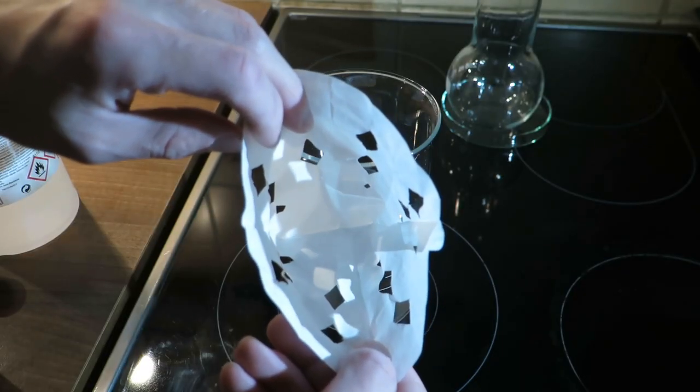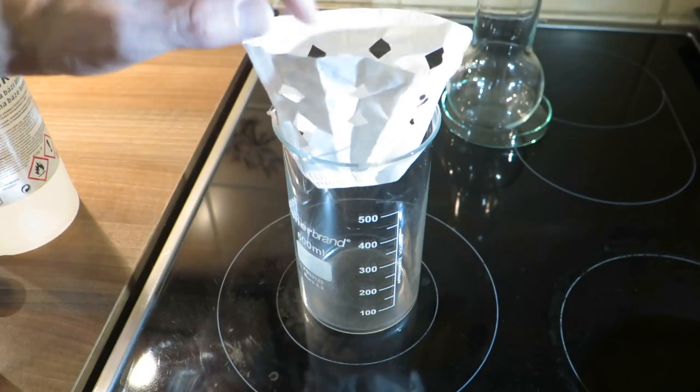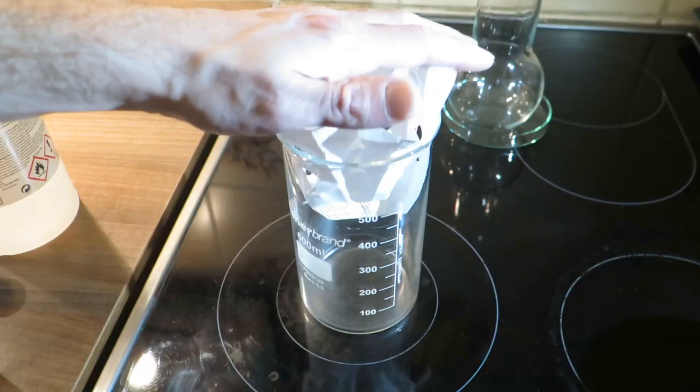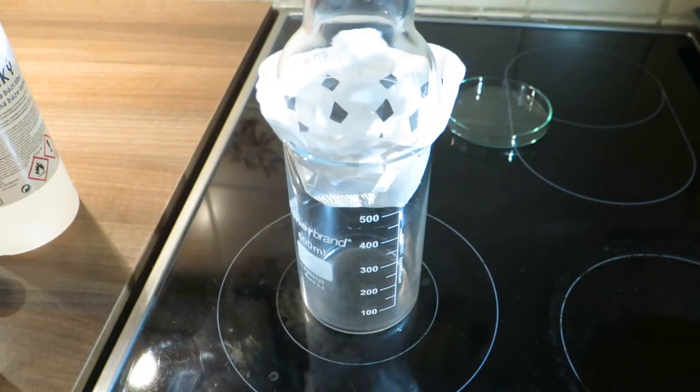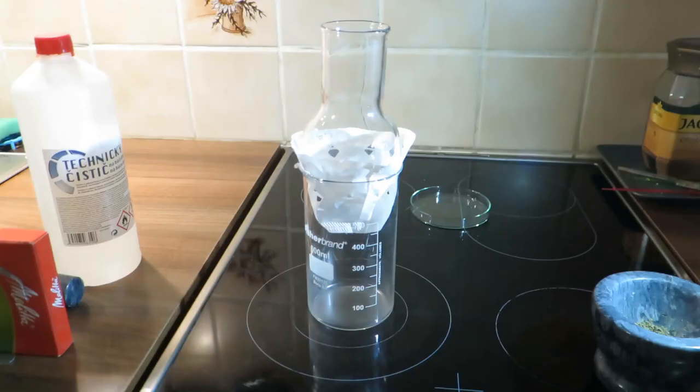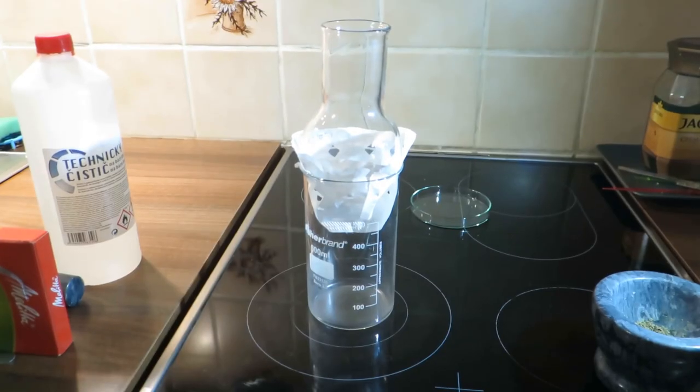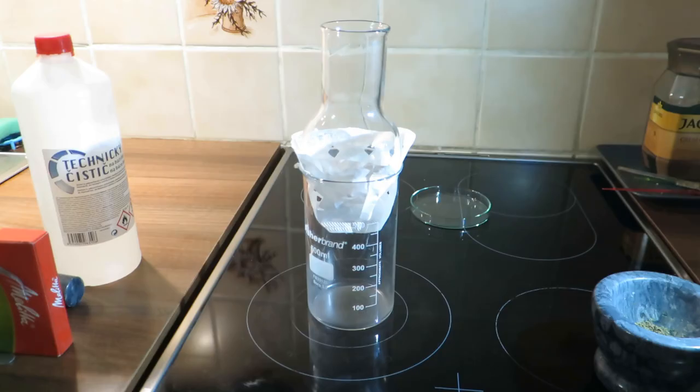This is just basic filter paper that I modified to allow vapor to pass through it. Of course it has to be compatible with your solvent. On top of that you can place a container that you will fill with cold water. Ideally this should be a glass container, but in the past I have used even polypropylene plastic cups.